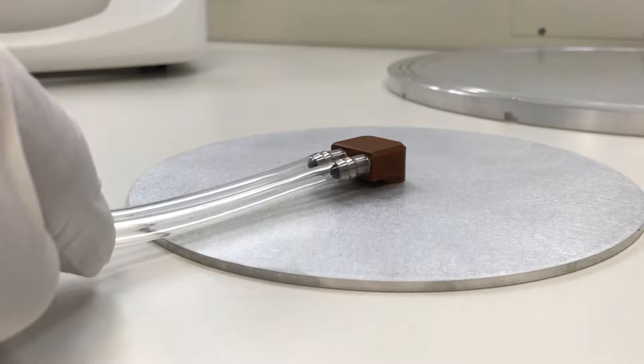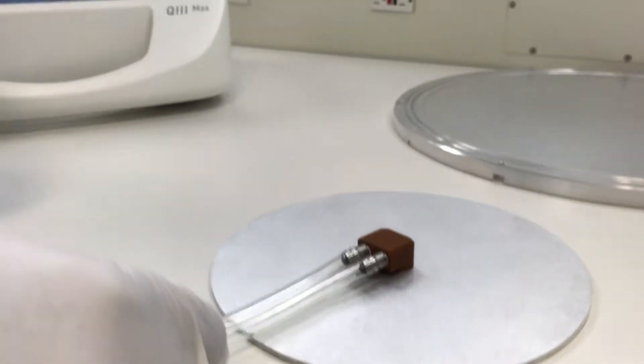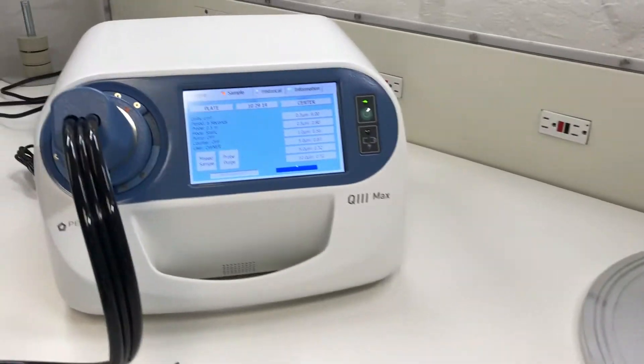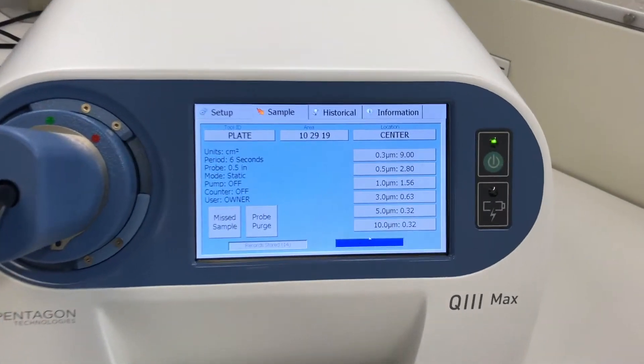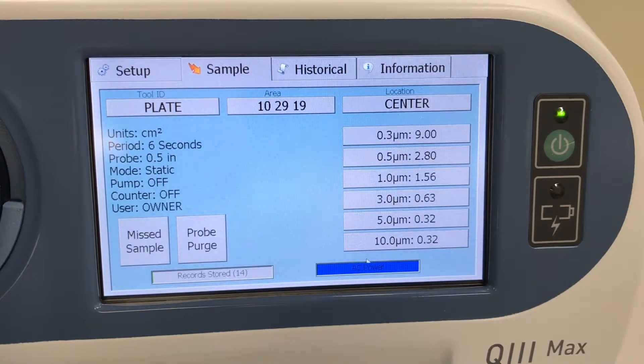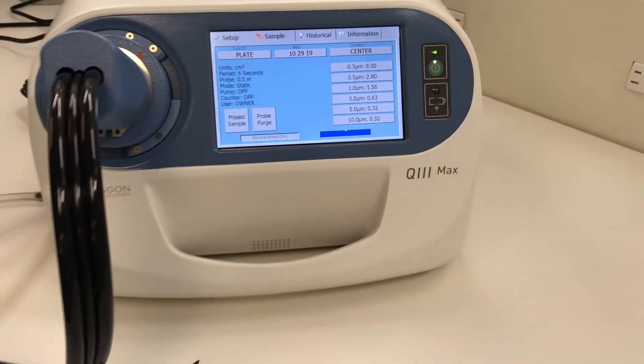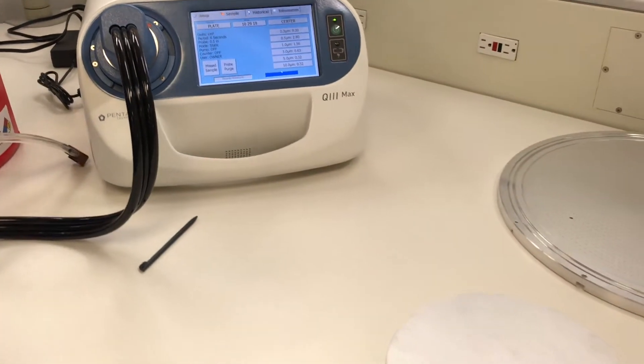Now we are going to measure the surface particles on a blank aluminum plate that has already been wiped with a wiper and IPA. The results show that the particle density is nine particles per centimeter squared greater than 0.3 microns measured in six seconds. Notice how the screen also shows the settings.